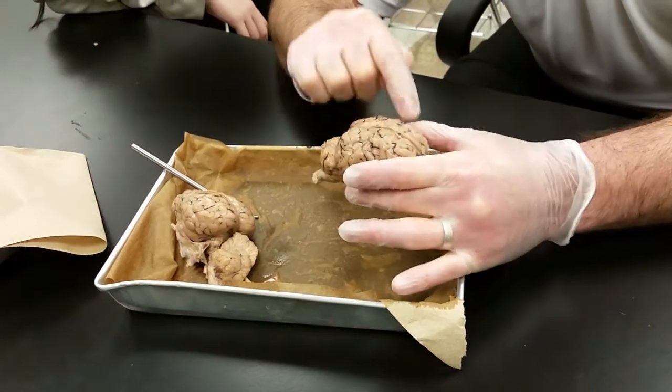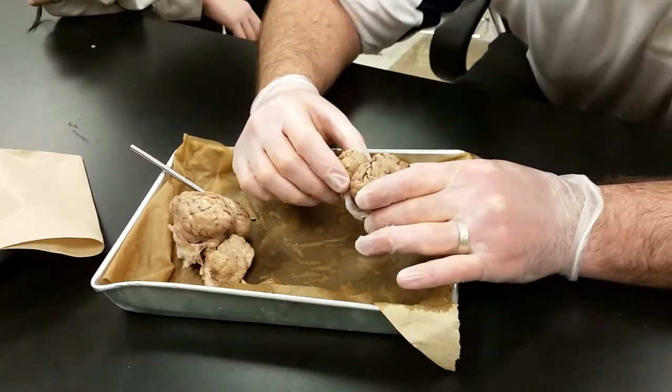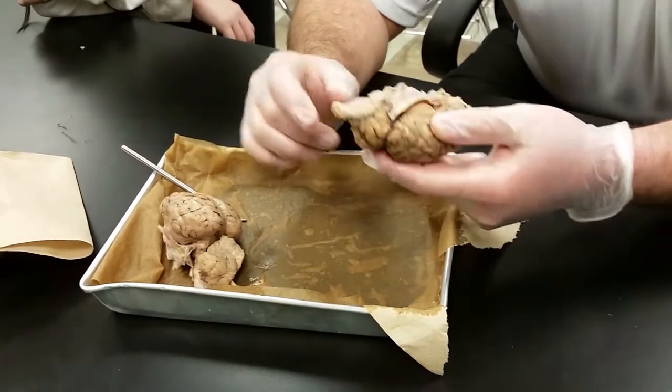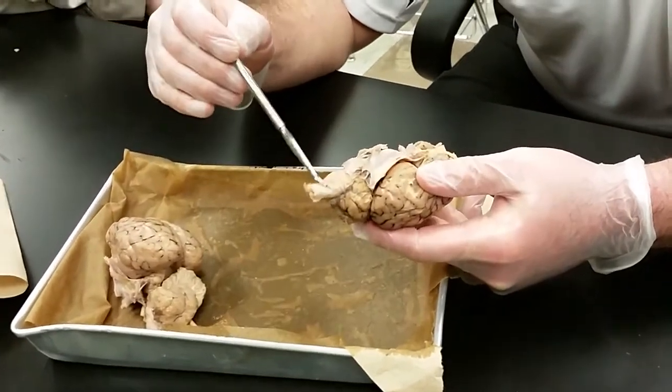The largest portion of the brain is the cerebrum. The smaller region behind here, this is the cerebellum. And then you have the medulla. So those are the three main portions of the brain.